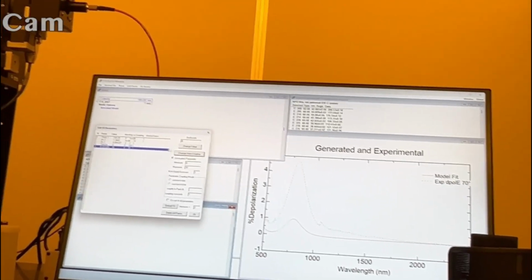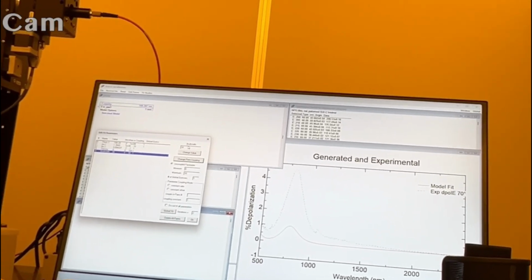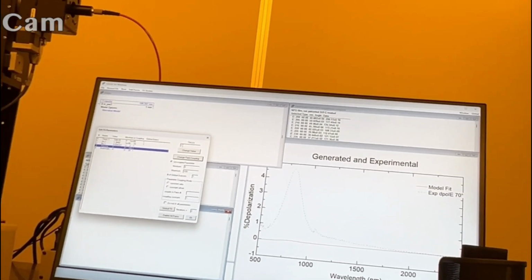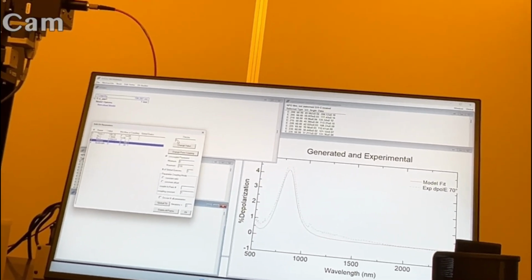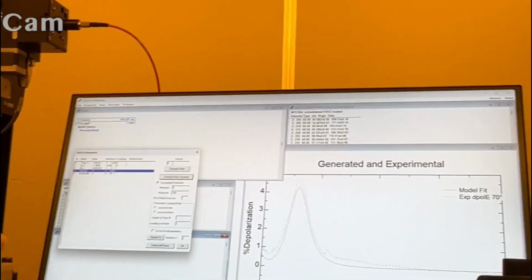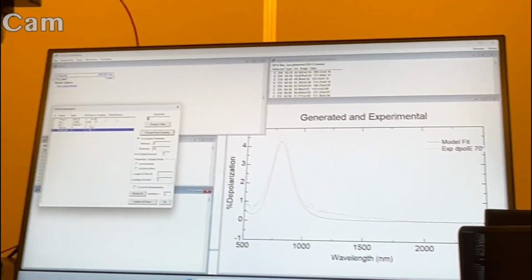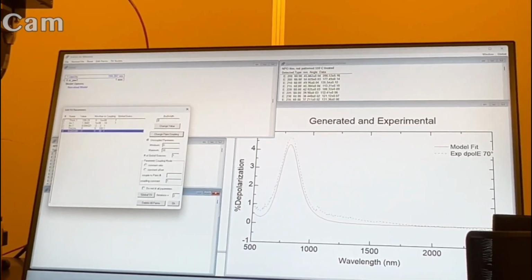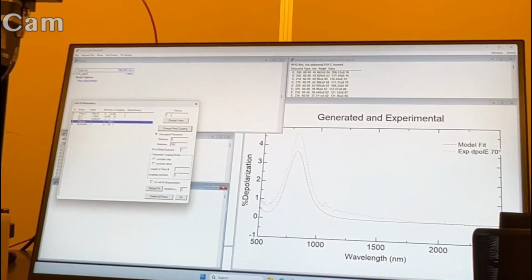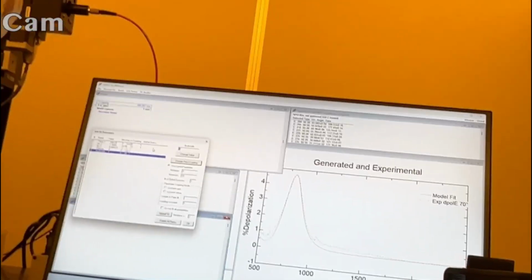Both could be similar. So if I change that value to 0, sorry about that, and instead add some thickness non-uniformity for fun, you can see it doesn't take too much, but sure enough, 8% is a pretty large area. I don't know if that's fully correct, but you see it accounts for that. What it really might be is, say, 3 nanometers of bandwidth and maybe 7% non-uniformity, so there might be a mixture, but they do a very, very similar effect. So just keep that in mind.